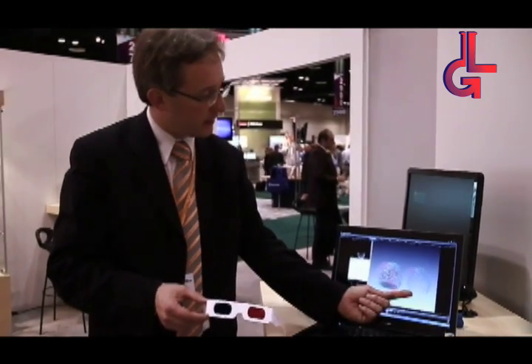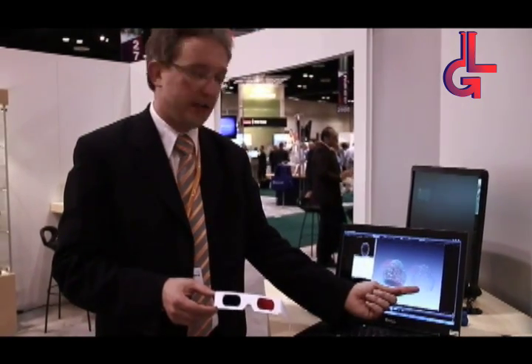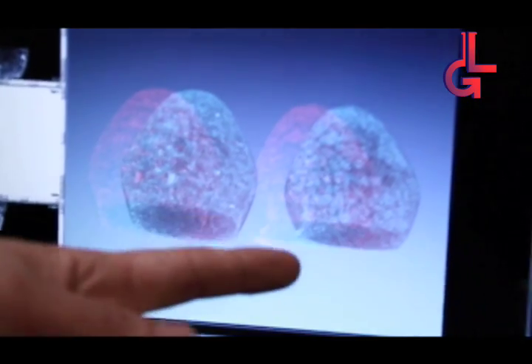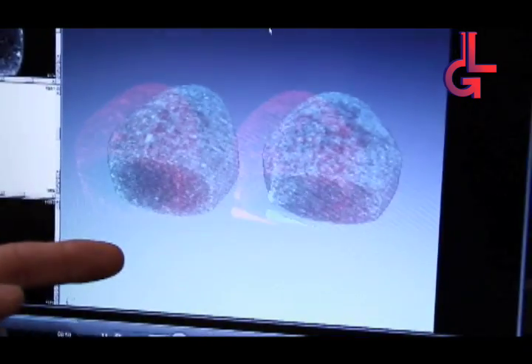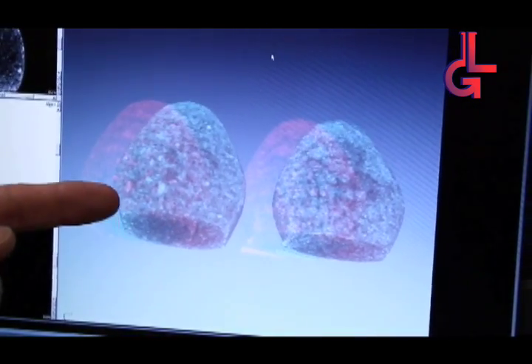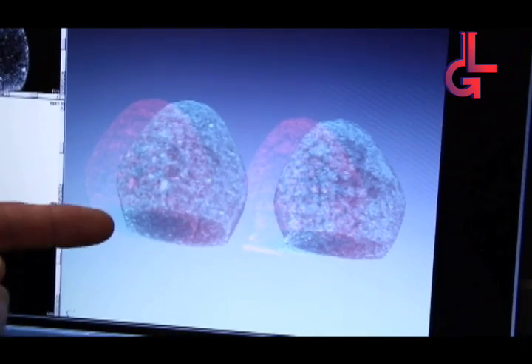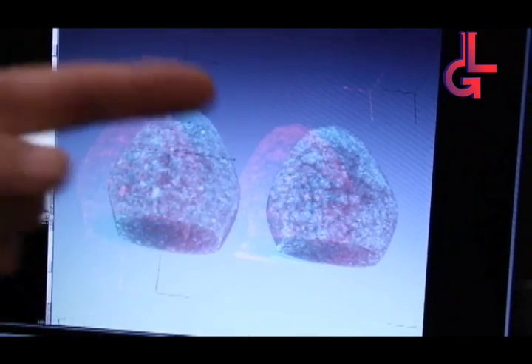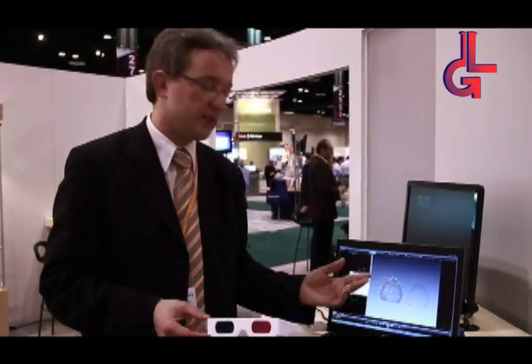It is very clear that the original one here on the right hand side is nice and smooth. But the counterfeit one contains some large particles in there which affect the bioavailability of the drug and which could have adverse effects to the people who use these counterfeit medicines.